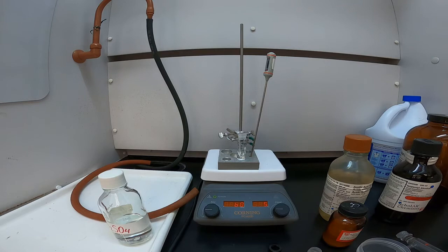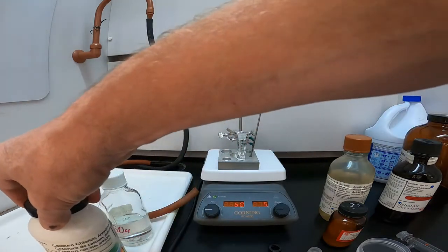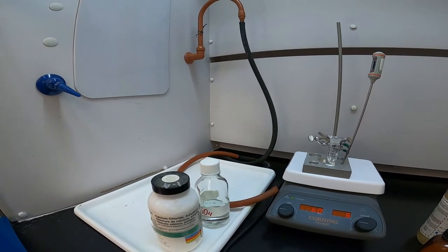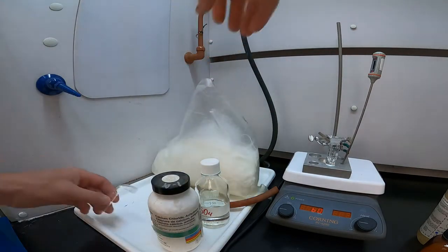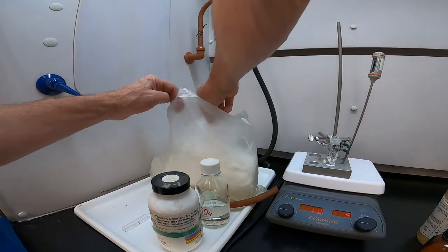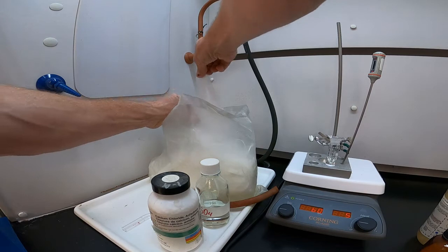And then we'll also prepare what's called a calcium chloride drying tube. The purpose of that is so that when the reaction is heating, water vapors from the air don't get into the reaction, because they would cause the reaction to proceed to a lower percent yield. So to prepare the simple calcium chloride drying tube, that's the first thing I need to do to get the setup ready.